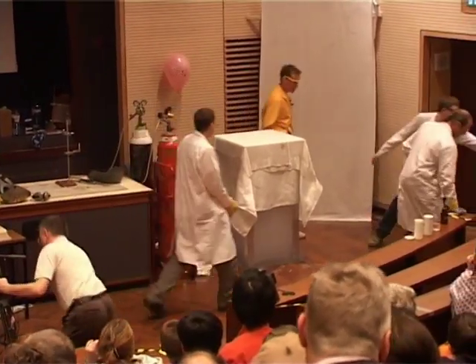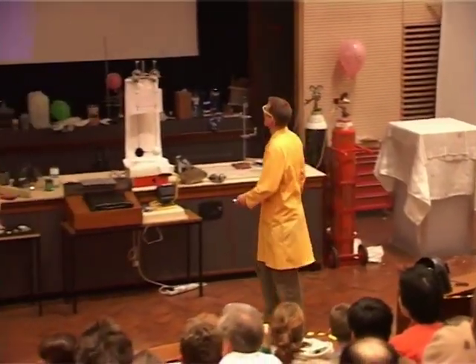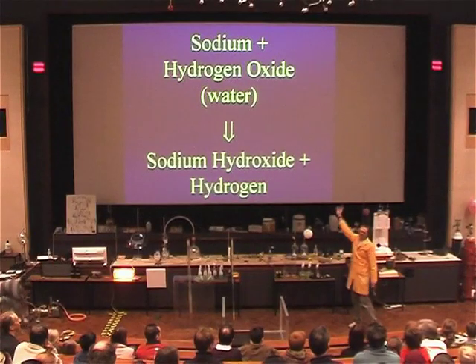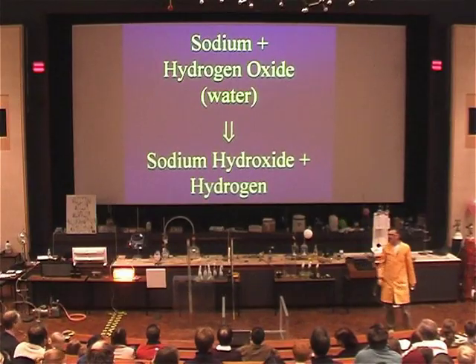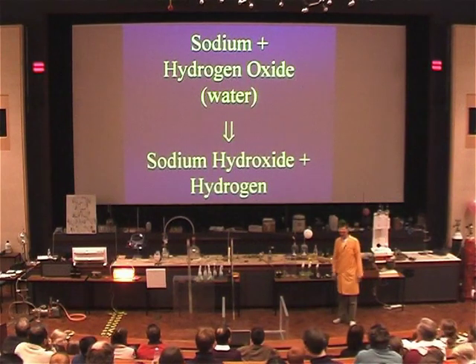So you see now why you mustn't mix sodium and water together. Well, there's a chemical reaction going on there. Sodium reacts with the water, which we could also call hydrogen oxide, and it forms sodium hydroxide and hydrogen gas.